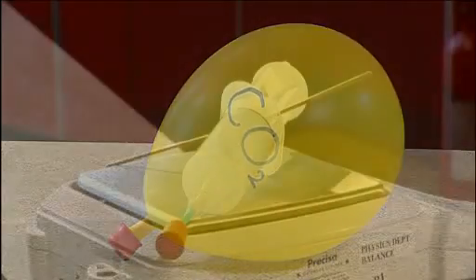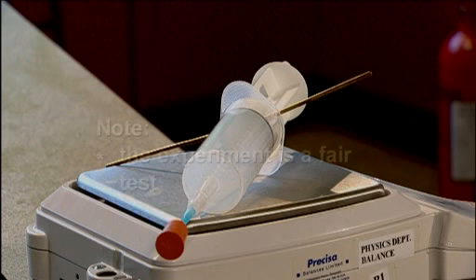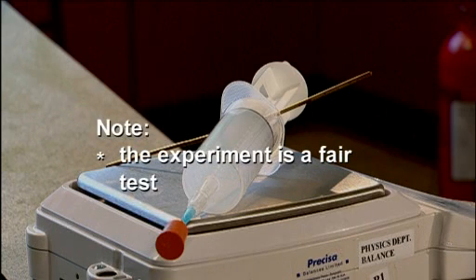Some students may not see why the syringe cannot simply be weighed with the plunger at the 0 mark to give the weight of the empty syringe. This can be explained by reference to buoyancy, or, more simply, by pointing out that weighing the syringe both times with the plunger at the 100 cubic centimeter mark is a fairer comparison.